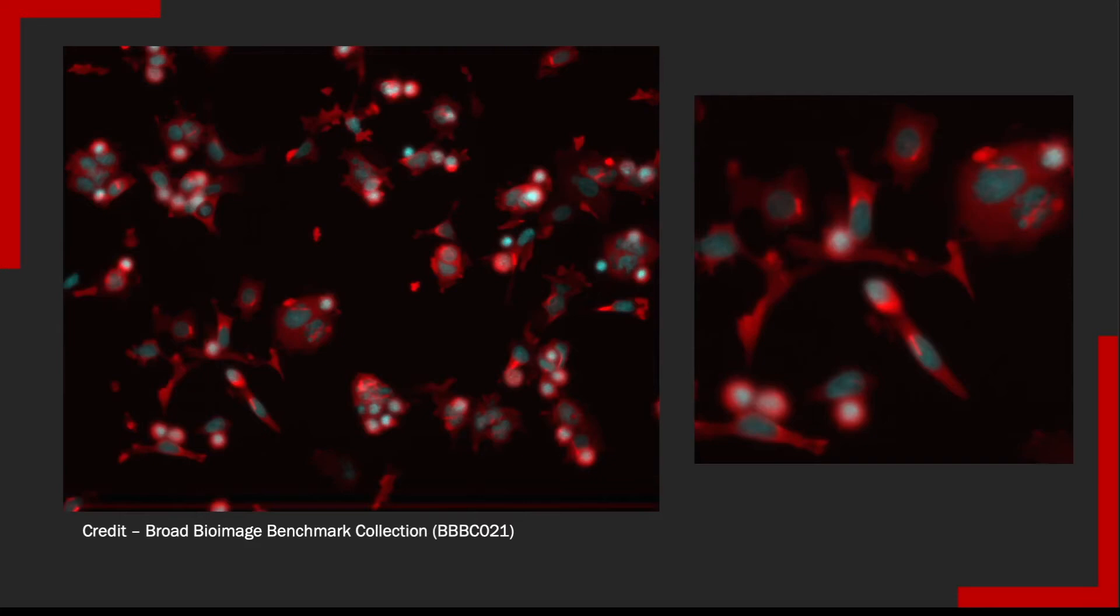If we add a drug that compromises the cell's skeleton, the cells now have all kinds of different funny shapes because they can't hold their shape correctly.